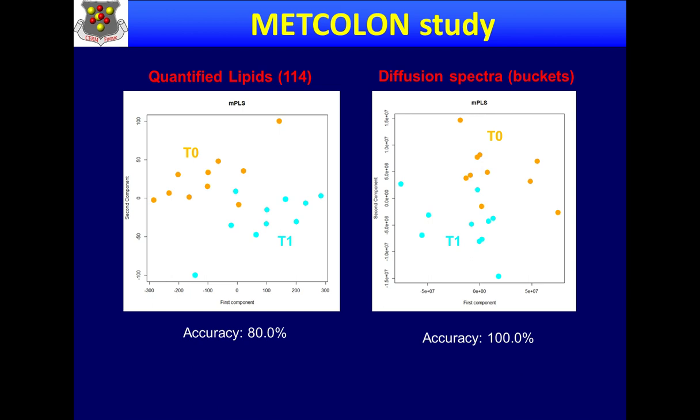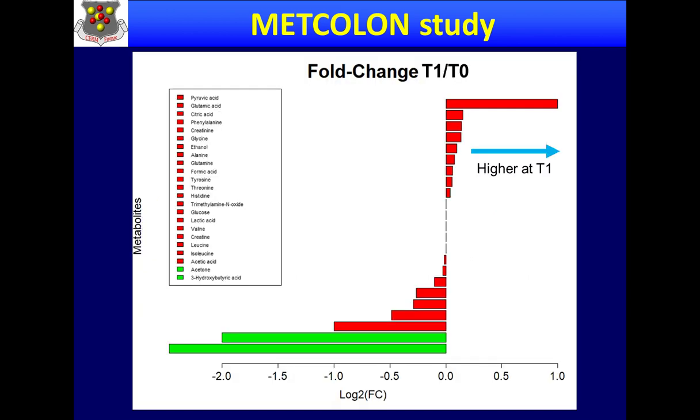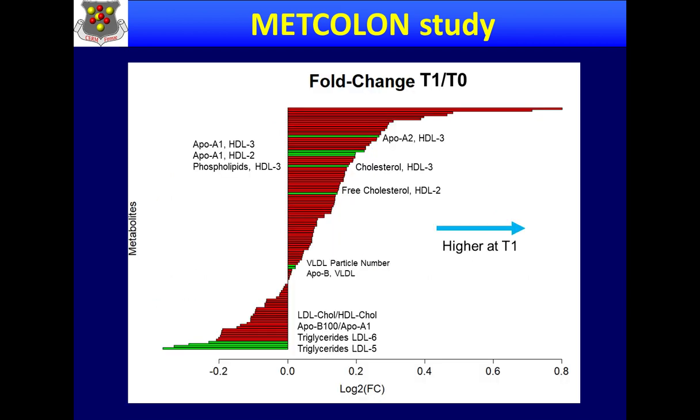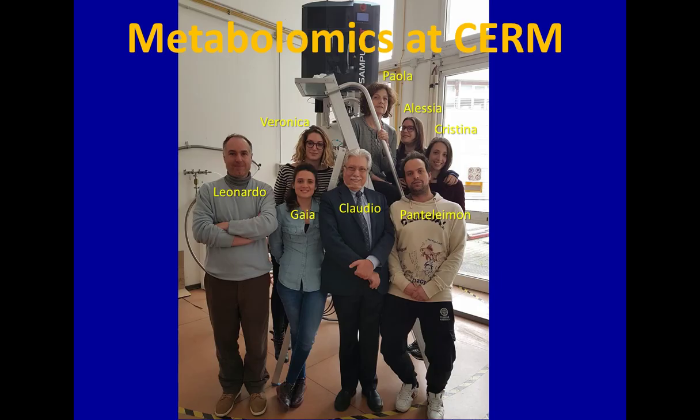Lipids are also informative, not as informative as diffusion spectra. You see that there is a parallel behavior. Diffusion spectra are sensitive to large molecules, and lipids usually give broad signals, so it makes a lot of sense. So again, I cannot give you the biological conclusions now because this is the very beginning of the study, but from our point of view it's encouraging that if we look at the right stuff, we are not losing much of the information, and we are gaining a lot in terms of zooming on all the differences. Again, triglycerides seem to be important, and I think I will close here.